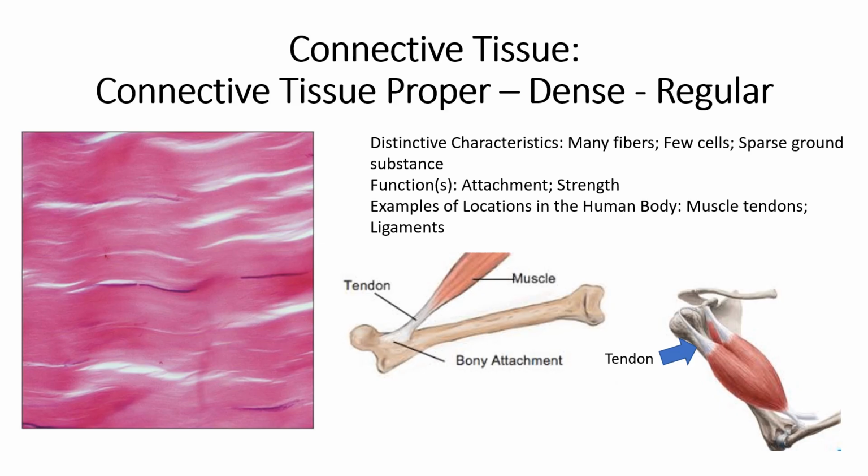Still thinking about connective tissue and connective tissue proper, but now thinking about dense connective tissue proper. One of the subcategories of dense connective tissue proper is regular, right?